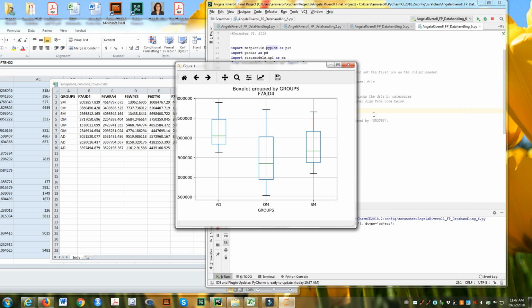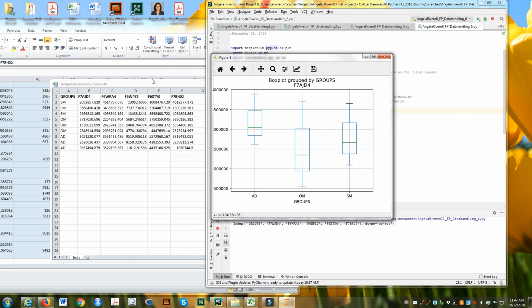And you can see that for one particular protein, that's the accession number, this was the control, this was the mean protein level for the cells that were differentiated into bone cells, OM, and then these were the ones that were differentiated into fat cells. This helped me to look a bit at the distribution of the points and the errors.